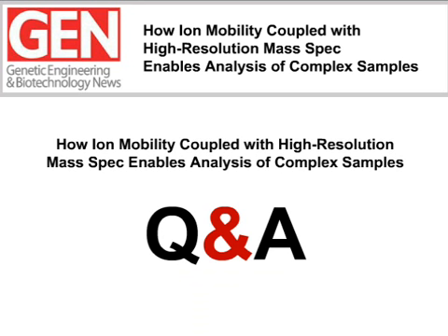Okay, thank you, John. And George, how is the sensitivity of the ion mobility QTOF compared to the regular QTOF with no ion mobility drift cell? Okay, thank you. That's another very good question. This has come up many times, and as you can see from the design that all three of us have talked about, we have used the electrodynamic ion funnels to help us focus and transmit ions through the entire ion mobility system.